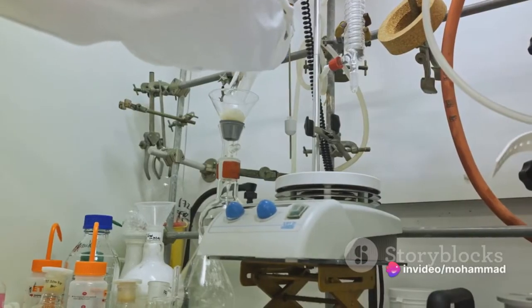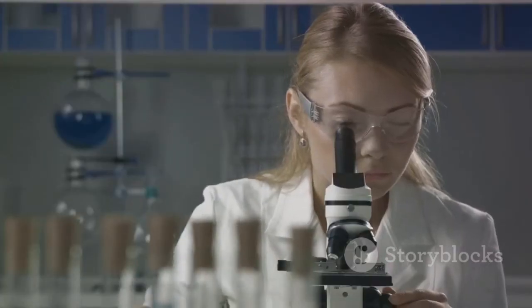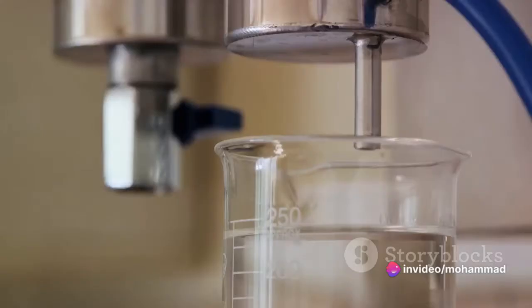Another limitation is the need for skilled operators. While GC machines are becoming more user-friendly, interpreting the results still requires a certain level of expertise. This can be a barrier in settings where such expertise is not readily available. And lastly, like any instrument, GC equipment can be costly to purchase and maintain. This could be a deterrent for smaller institutions or developing countries.